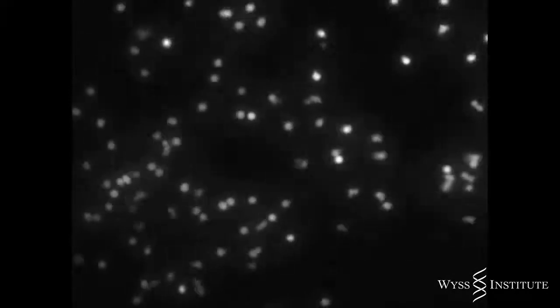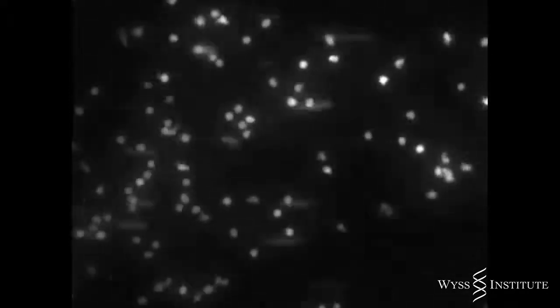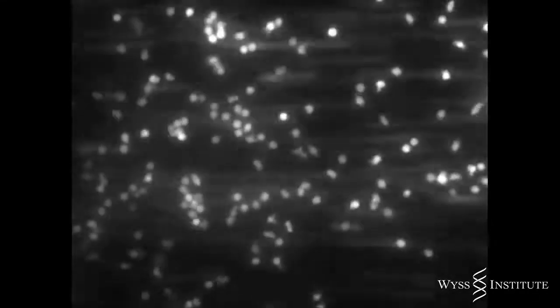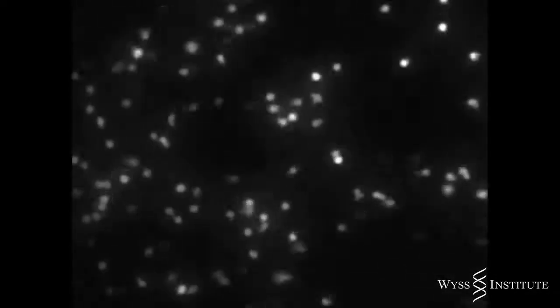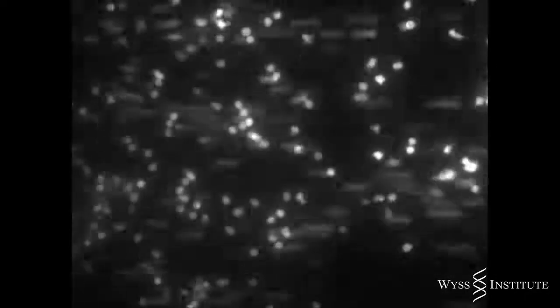But when we infect the air channel by adding bacteria, the immune cells abruptly stick to the surfaces of the capillary cells on the opposite side of the membrane, located directly below the infection site.